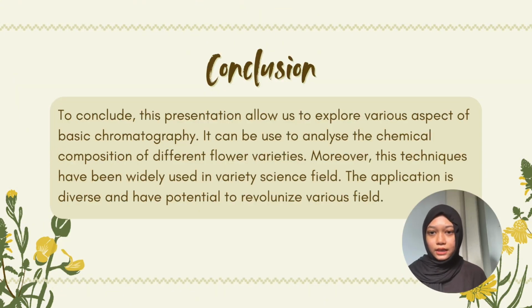And finally, the conclusion. To conclude, this presentation allows us to explore various aspects of basic chromatography. It can be used to analyze the chemical composition of different flower varieties. Moreover, this technique has been widely used in various science fields. The application is diverse and has potential to revolutionize various fields. That is the end of our presentation. Thank you.